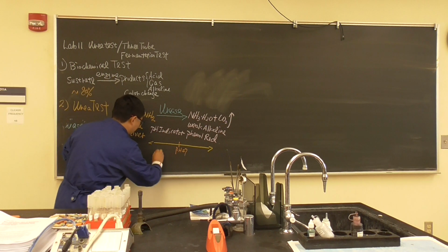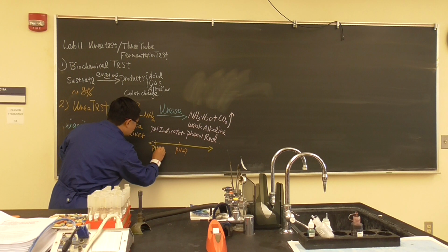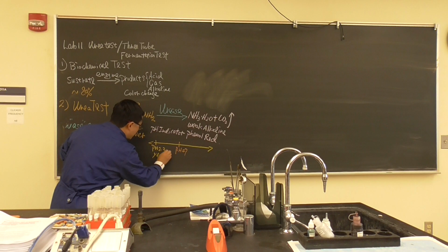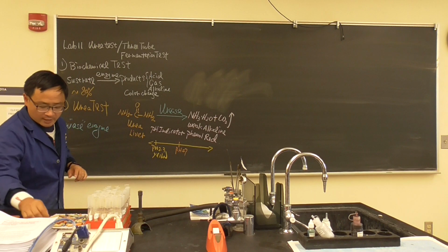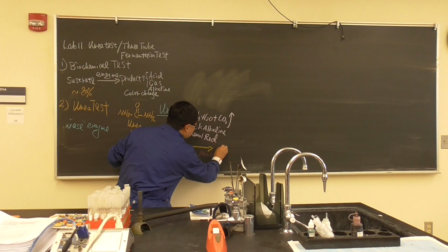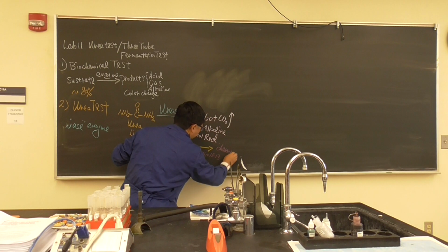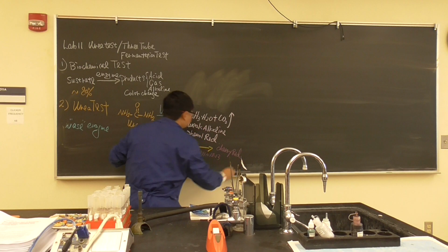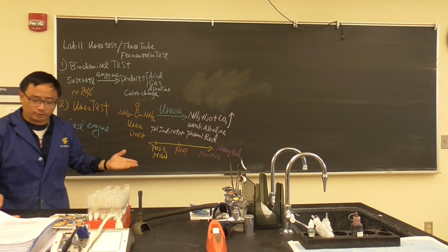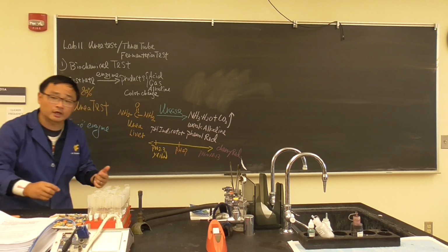In acid environments, pH 2 to 3, it is yellow, and in alkaline environments, pH 12 to 13, it is cherry red. And this reaction is very important for some bacteria.